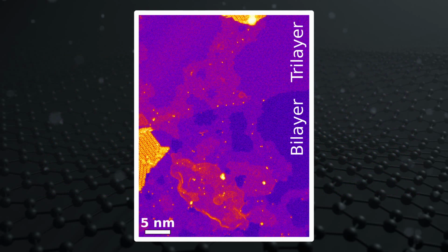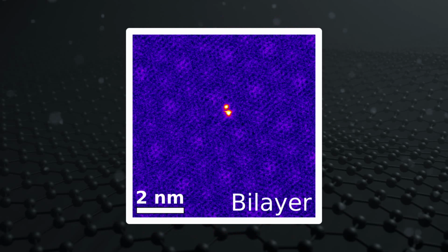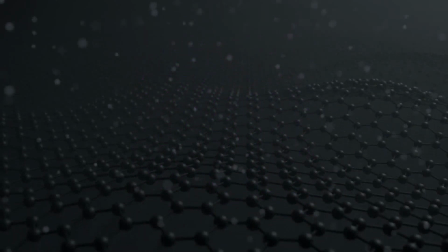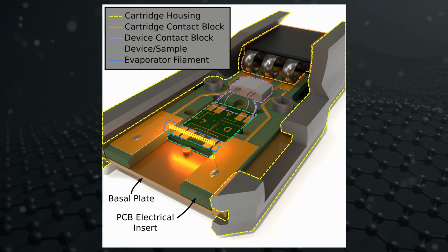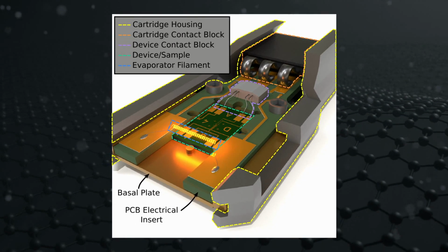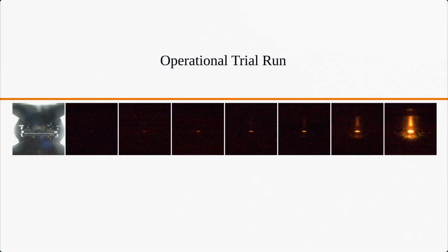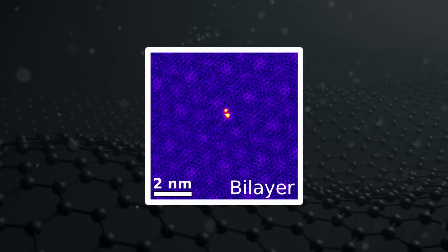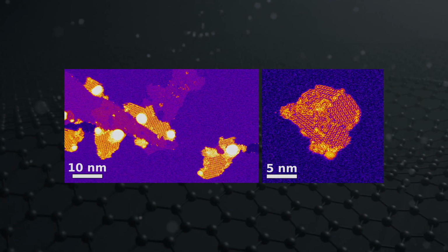This suggests that we were indeed able to deliver atomized tin to the sample, and represents the first step toward combining synthesis and atomic fabrication in the STEM. The development of a new platform for atomic fabrication and in-situ synthesis in a STEM represents a significant change in thinking about what is possible. This approach of combining bottom-up synthesis processes and top-down influence has the potential to break new ground in atomically precise manufacturing. The successful testing of an in-situ evaporative delivery platform demonstrates that it is possible to deliver single atoms and initiate growth processes in a STEM, and represents a crucial step toward realizing this potential.